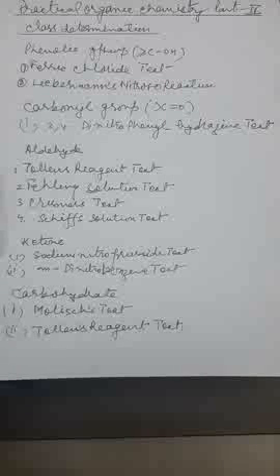C6H5OH in the presence of HNO2 gives para-nitrosophenol. Para-nitrosophenol in the presence of C6H5OH gives indophenol. The color is red. Indophenol reacts with H2SO4 to give green color. Indophenol again reacts with NaOH to give blue color.